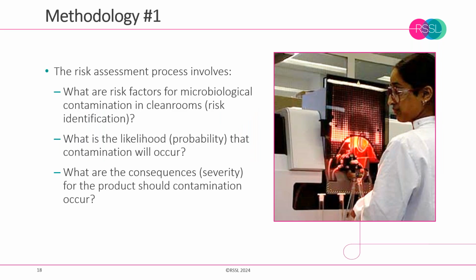So the approach taken was to first of all identify these risk factors, and we'll have a look at those in a moment. So what are the things that can either influence microbial presence or microbial survival or even microbial transfer? What's the likelihood that the contamination will occur? And what are the consequences or severity should that contamination occur and exist for a prolonged period of time?